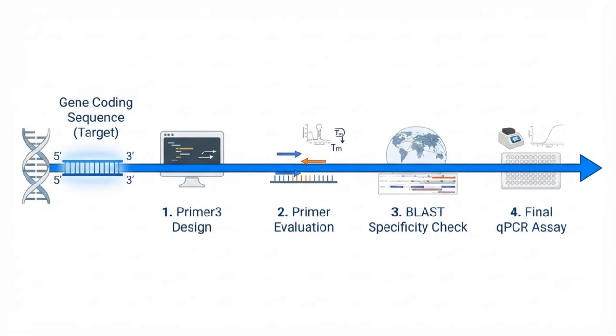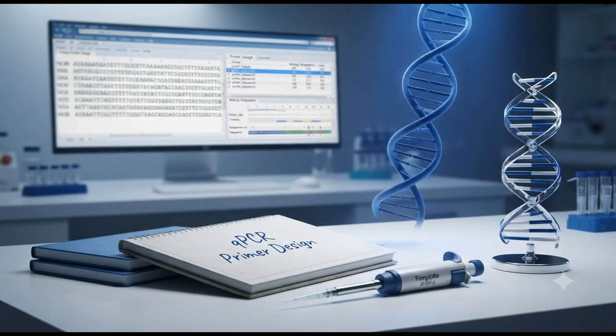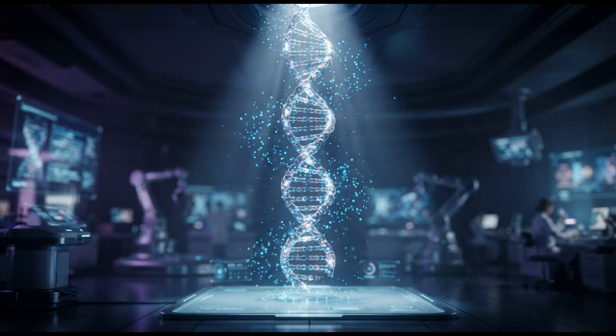We'll use this exact sequence throughout the rest of the tutorial. Before we start designing primers, there's one principle you absolutely need to understand. In my opinion, this single concept separates good qPCR assays from bad ones. Before we open Primer 3+, there's one rule you should remember throughout your entire career.